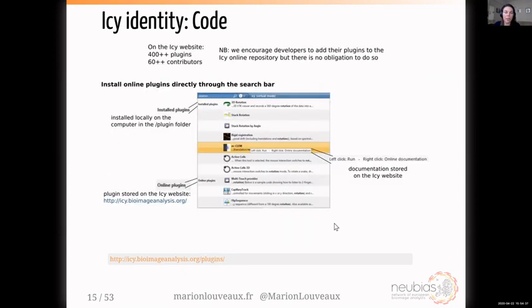To download plugins, go directly into the search bar of the ICY interface and start typing the name of the plugin or some keywords, for instance 'segmentation'. You'll see two types: plugins that are installed locally on your computer, and plugins that are online stored on the ICY website. If you click on an online plugin, it will download from the internet. You can also right-click to go to the online documentation. We encourage developers to add their plugins to the ICY online repository, but there is no obligation.